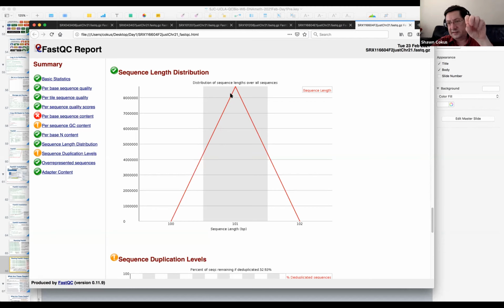They're not always in sync, and so you need to do this deconvolution forward and back. That's why, if somebody orders a 100 base run, you often run 101 bases, so at least the 100th base has a base after it to get some information back in. Of course, no matter what length you run, it has to be a last base, and that base only gets corrections from one side. But they asked for 100, you gave them at least 101. They can't complain. Anyway, that's why often you'll see 101 instead of 100.